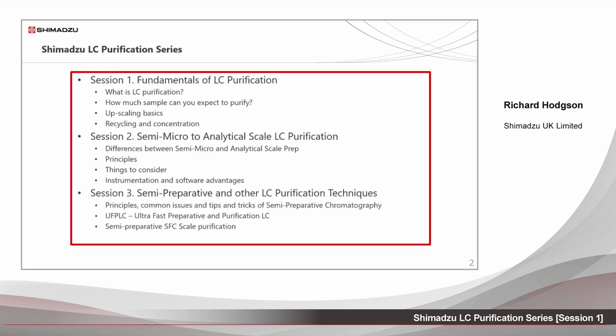Lastly, session 3, titled Semi-Preparative and Other LC Purification Techniques. This will cover principles, common issues, and tips and tricks of semi-preparative chromatography, UFPLC, ultra-fast preparative and purification LC, and semi-preparative SFC scale purification.